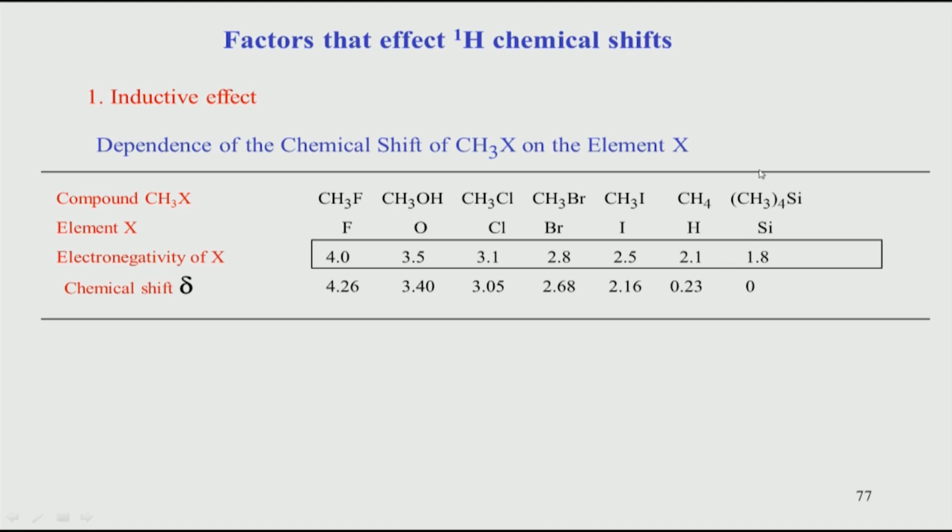So, that has been designated as a reference all over the world, and with respect to that reference you calibrate. So, we use the word calibration. Calibration is basically deciding first, setting the chemical shift of the reference to 0, and with respect to that you can measure any other chemical shift. So, the point to drive home here is that the chemical shift reference is in a way an arbitrary concept. You arbitrarily decide one particular hydrogen atom as a reference and measure everything with respect to that.